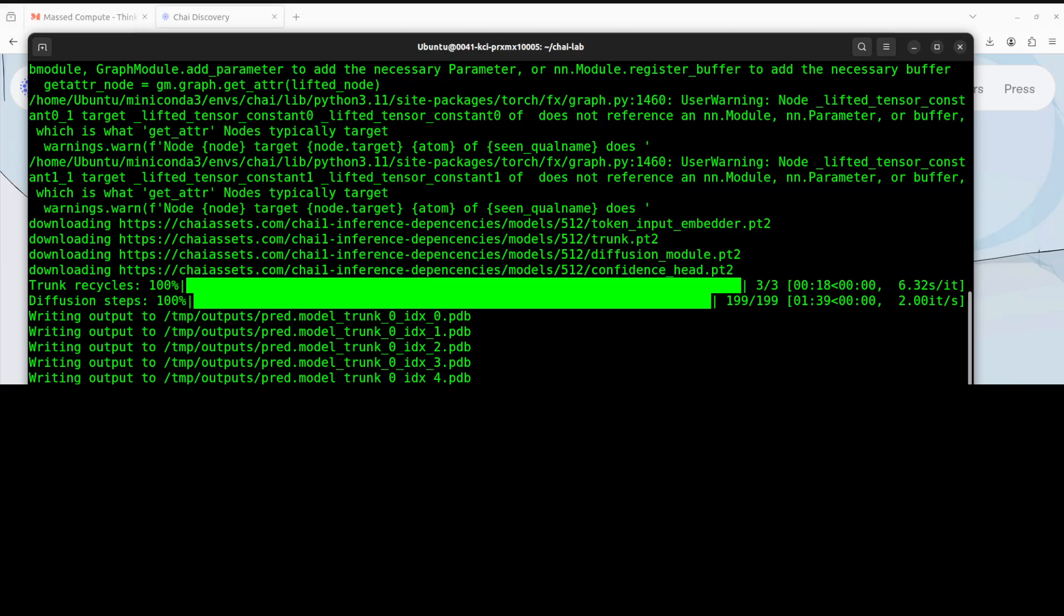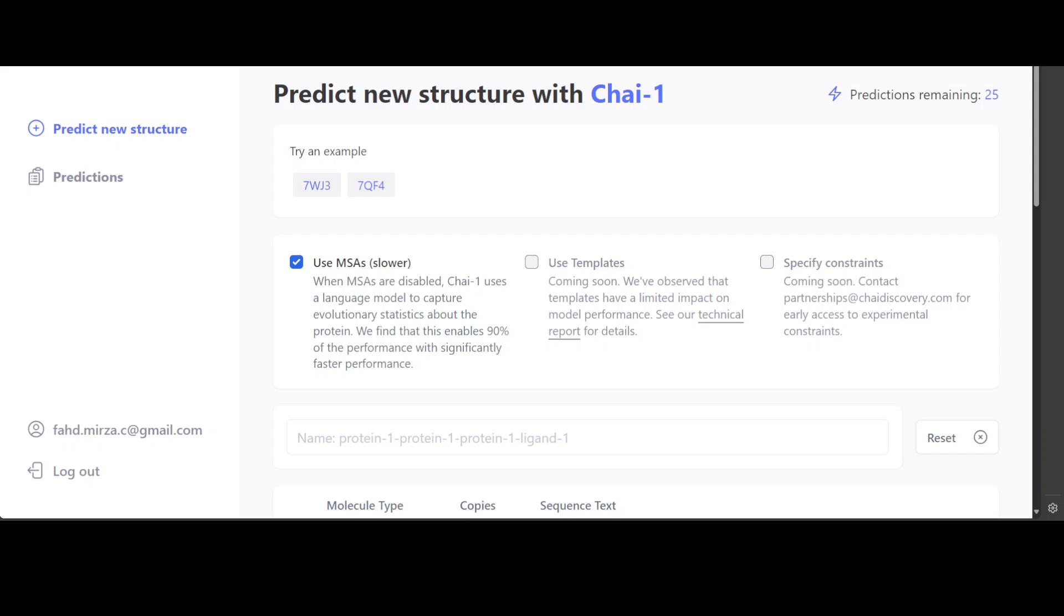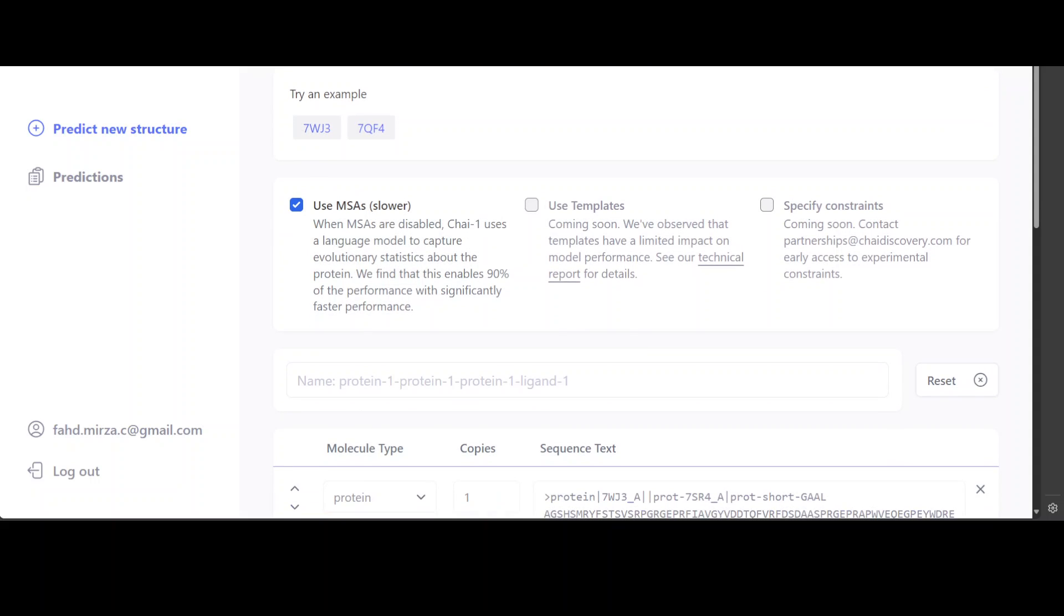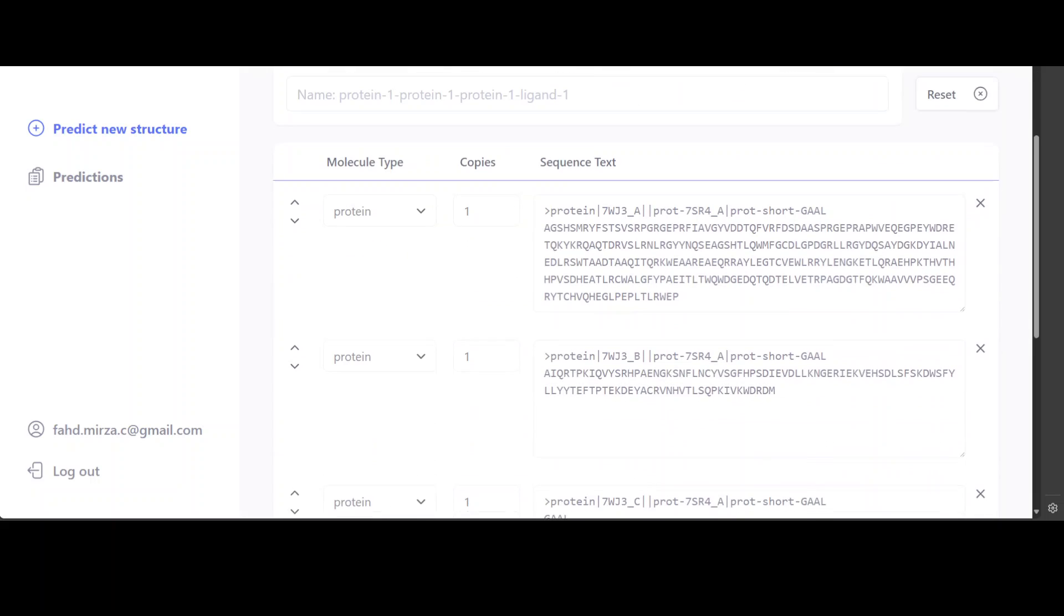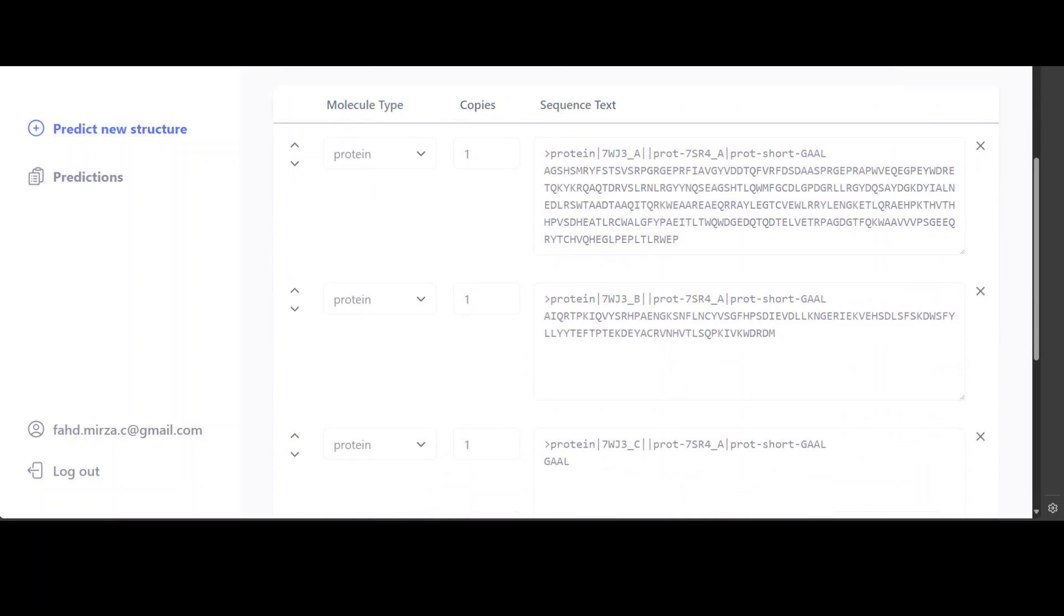And now let me show you how it looks like in the browser. So you see, once you log in, you can predict new structure. You can just go with the existing one. You can try like provided examples as we just saw.